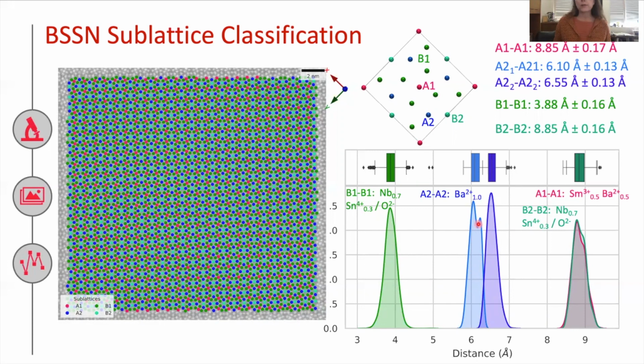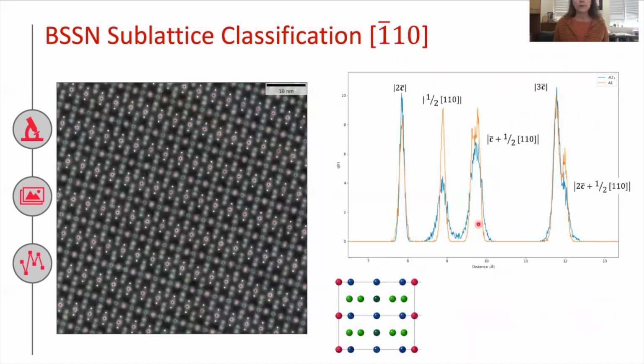So this has actually taken quite a bit of work to be able to do this automatic sublattice classification. But once you do that, it gives you a lot of freedom to look at the statistics of the local structure in these more complex crystal systems.